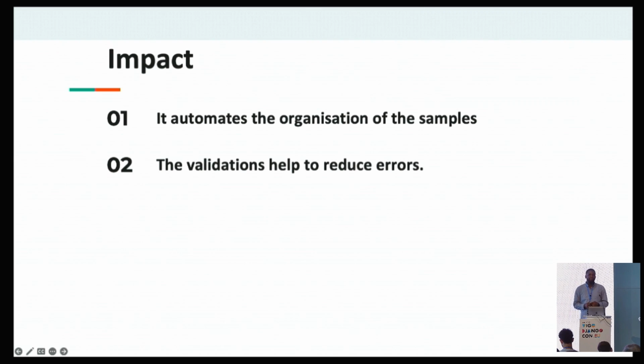Like if you discover that this particular sample is faulty, and it has been plated already, you need to move it from this particular rack to another rack. So we're able to do some data validation that you have the right sample picks. If the system checks that the sample you want to return is not in this particular holding rack, it's going to give you an error: sorry, you cannot return this particular sample.